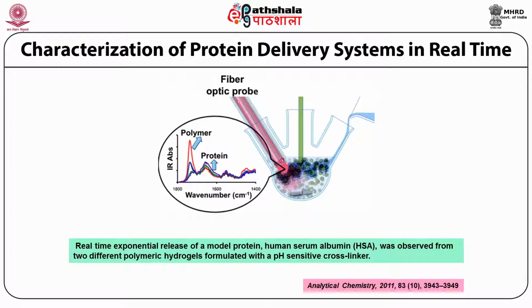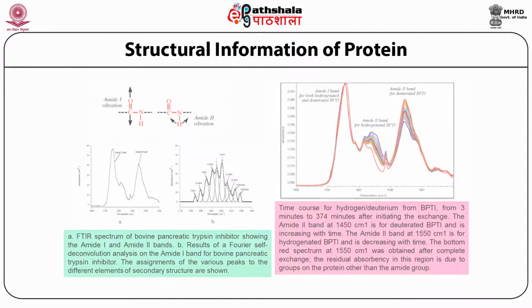dependent manner, the peak of protein intensity increases, and that is where you can take advantage of real-time FTIR to see the amount of protein released from the hydrogels in a time dependent manner. It gives you the idea that structural information on protein can be derived from FTIR.